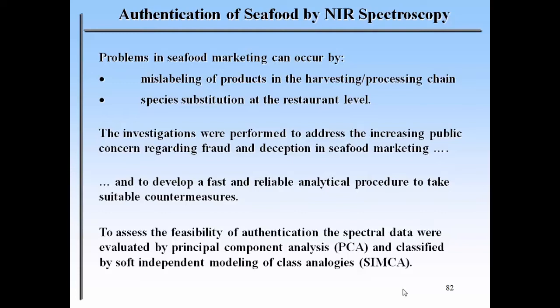We tried to use this mini instrument for authentication by principal component analysis in combination with so-called soft independent modeling of class analogies, SIMCA. It's a chemometric procedure which requires a previously run PCA, which is then fed into the SIMCA algorithm in order to discriminate classes.